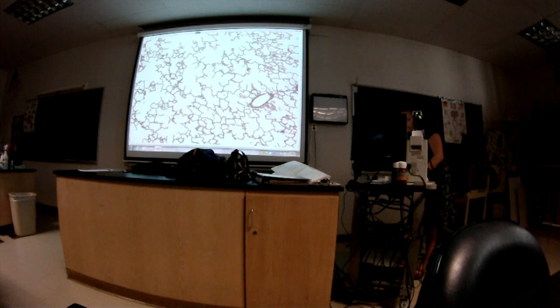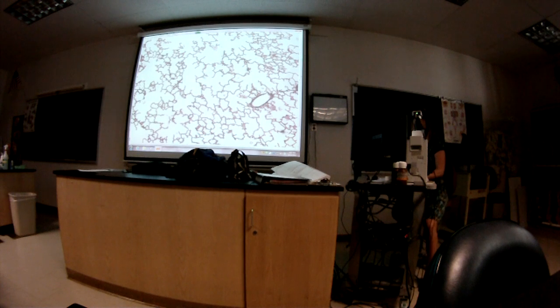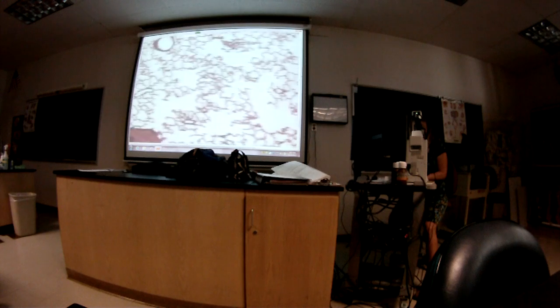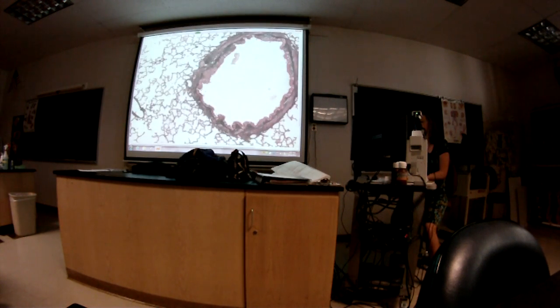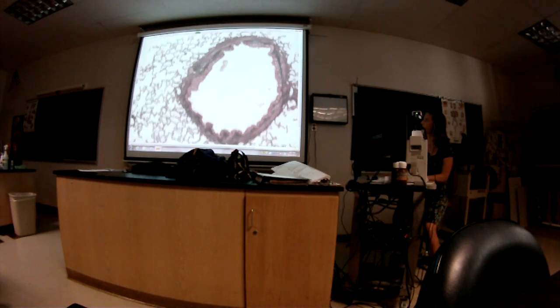Okay, question 8 was, what's this organ? The lungs? Yep. Questions 9 and 10, those are probably the hardest ones so far, I think. I don't know if that's the exact same one, but it sure looks similar.